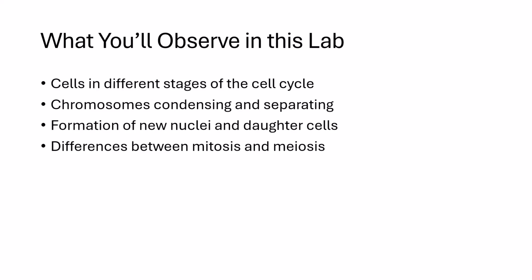As you work through the lab, your goal is to use visual evidence to recognize each stage, describe what is happening to the chromosomes, and connect these observations to the roles of cell division in growth, repair, and reproduction.